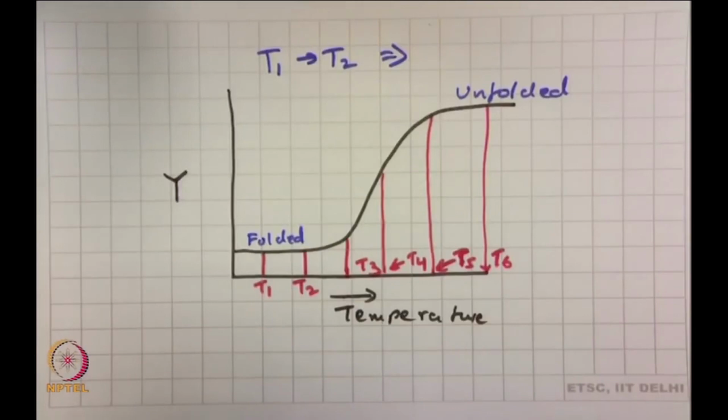It is a little bit better, because when you go to T3, you have just started unfolding the protein, is not it? Okay.